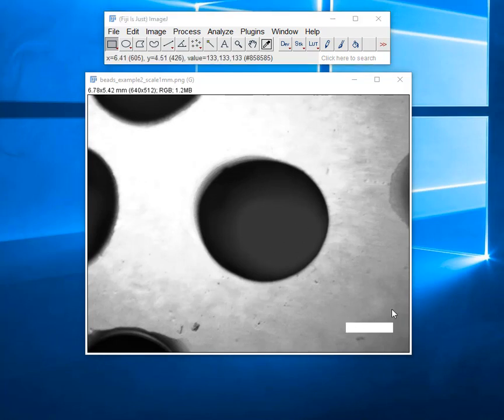And this is something you're going to have to do for any published results. You're going to have to be able to put a scale bar on your images. So it's a great skill to learn.